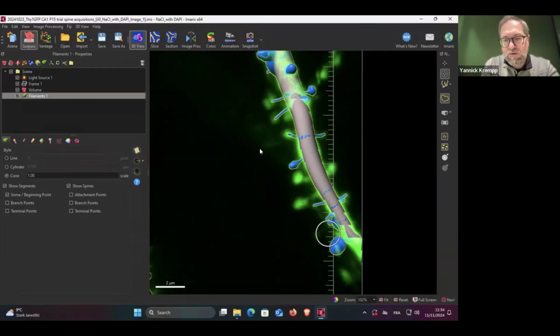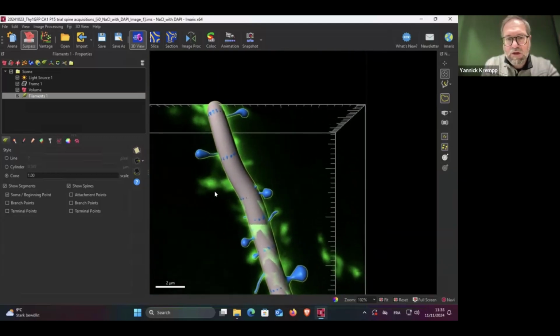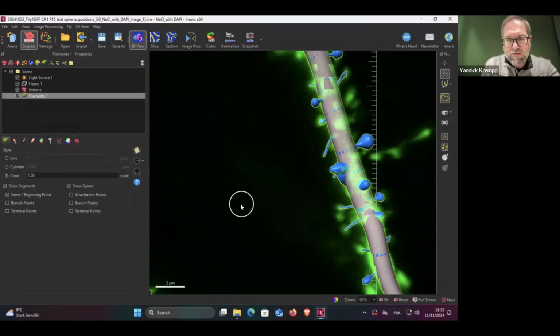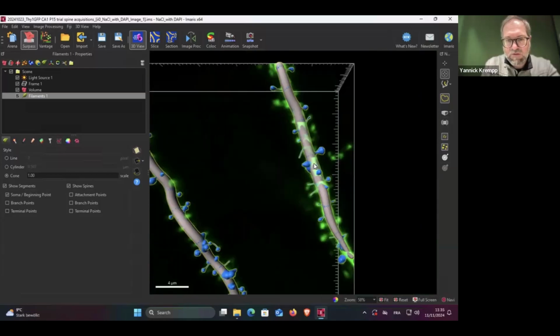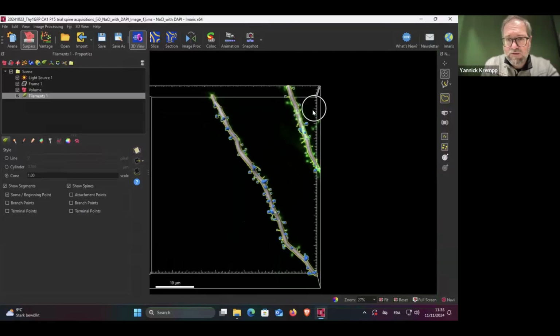Here you can see a few of them didn't make it to the cut, and this is probably because the signal is so widely different from one filament to another. But in any case, I think this can help to have the most robust detection. You just have to know that it will never be perfect in any case.